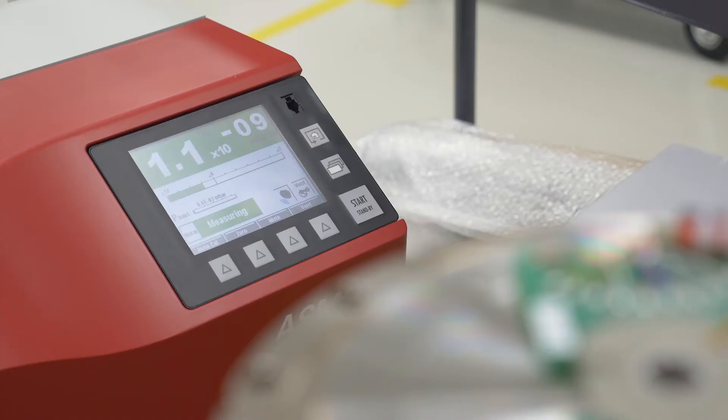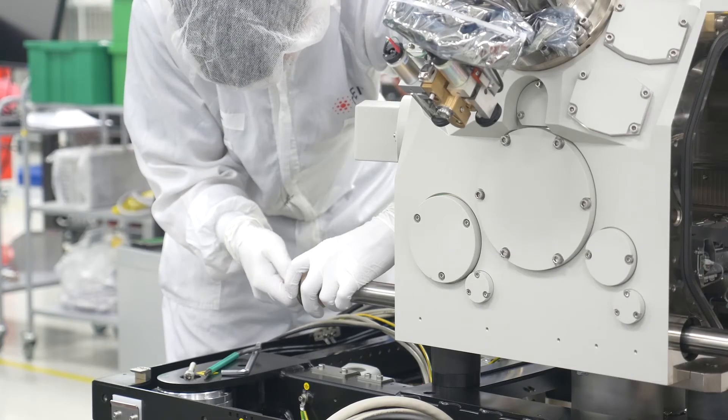If the detector does not discover the presence of helium in the system, they know in FEI that the part is perfectly tight and they can move to another phase of production.